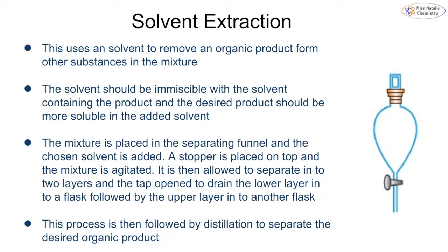The most important part is that the solvent that we use should be immiscible. Okay, we want to be forming layers. So it should be immiscible with the solvent that the product is in, and the desired product should be more soluble in the solvent that we're adding.